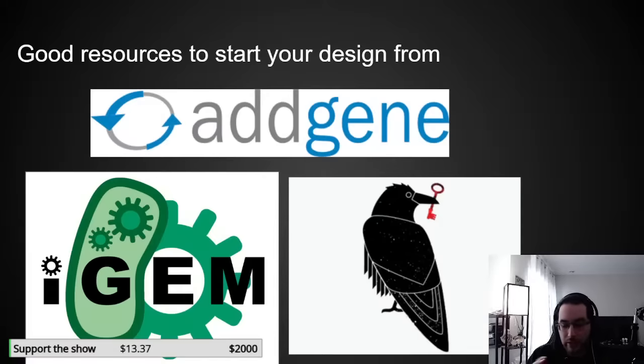Basically, when I'm trying to design something, or I want to do something genetically, I'll always start by finding papers, reading through them, and seeing what other researchers have done. Then maybe if I'm lucky, I'll be able to find their code on Addgene, or maybe it's posted in the supplementary of the paper. And then from there, you can start going in and messing with the DNA. But these are all great resources to start with.